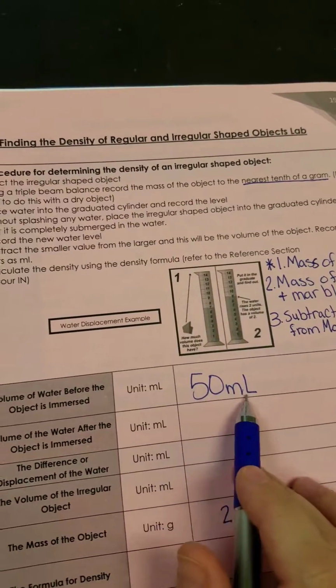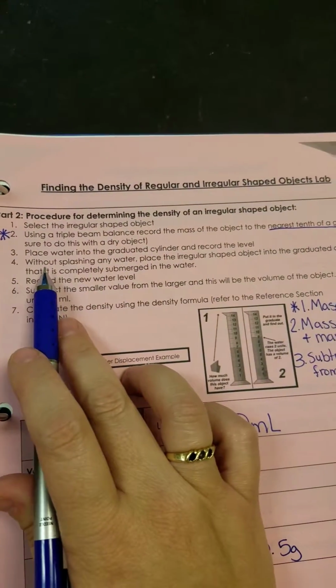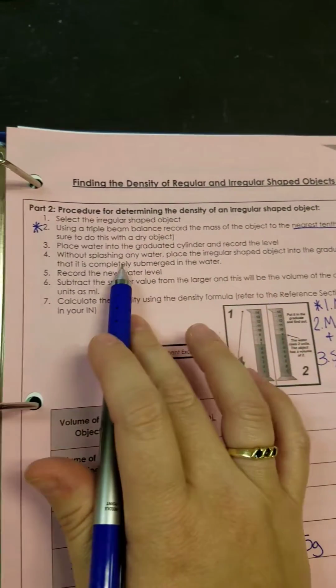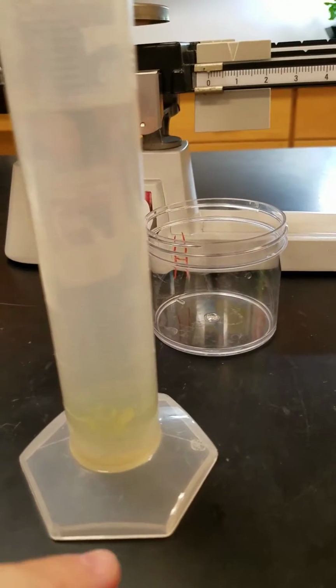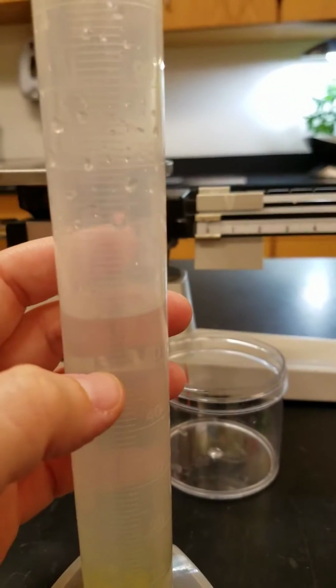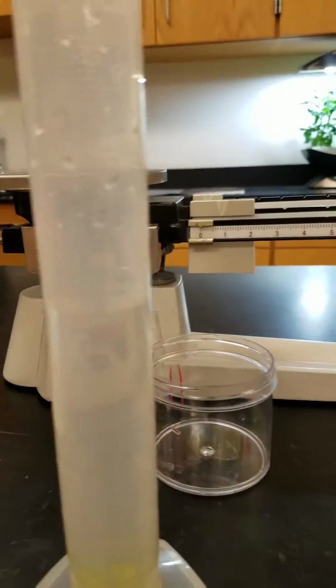All right. Place water into the graduated cylinder and record the level. Well, we have put 50 milliliters of water in our graduated cylinder. Without splashing any water, place the irregular object into the graduated cylinder so it's completely submerged and record your new water level. So it's a little hard to see, but the marble is down there. We were at 50, which is here, and now we're up to this line, which is 58.